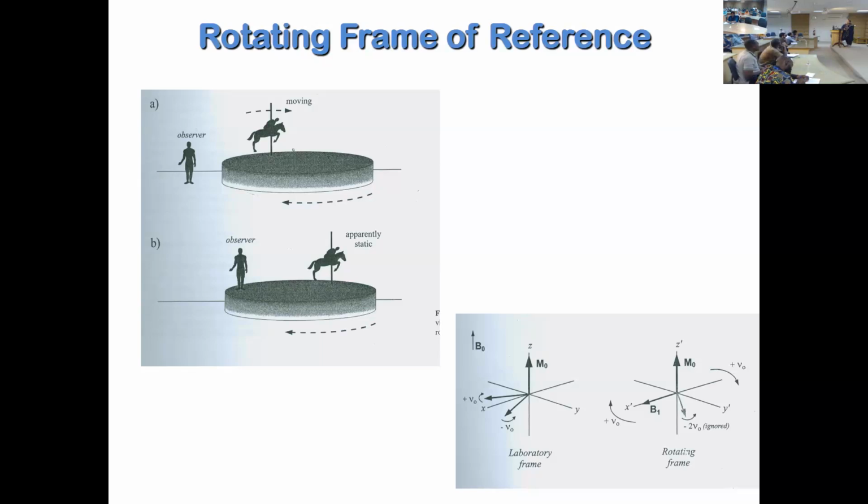Why a few hertz? For example, take a 500 megahertz spectrometer or a 300 megahertz spectrometer, whatever; these are the frequencies of proton NMR. It means each proton is moving with a frequency of 500 megahertz in a 500 megahertz spectrometer, which is very fast.